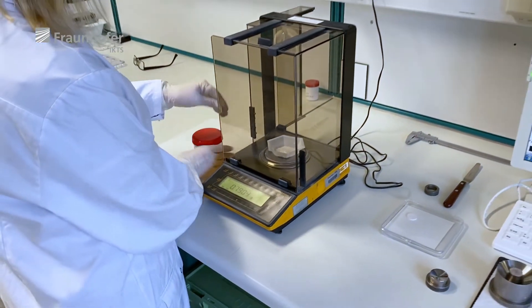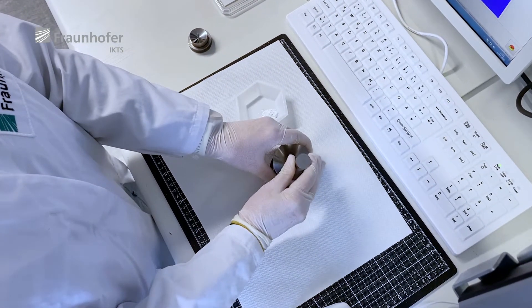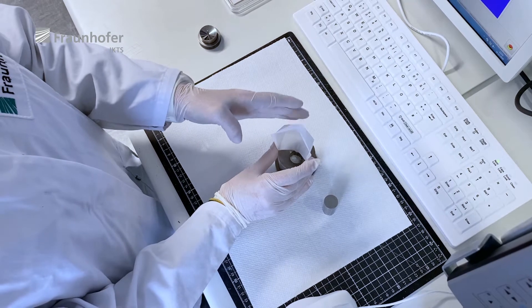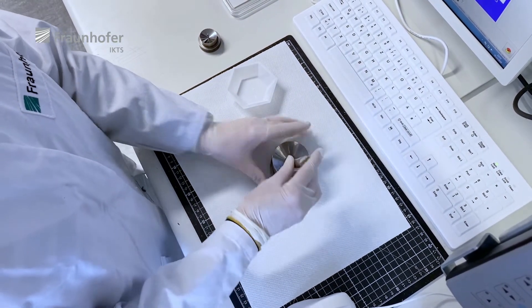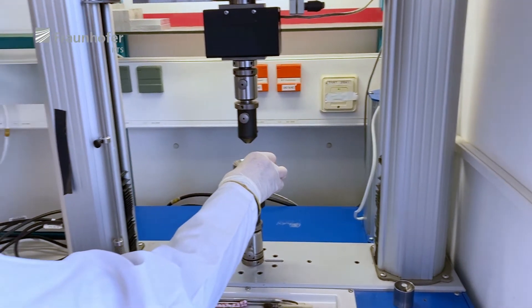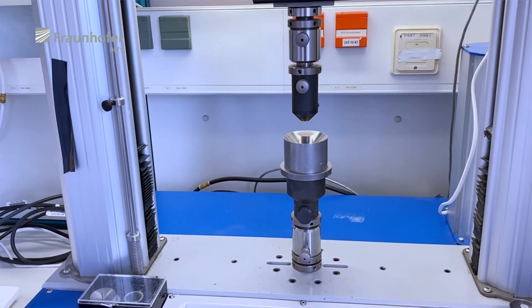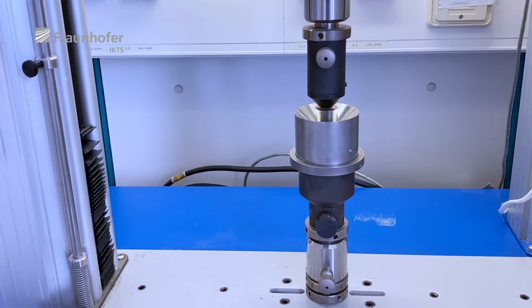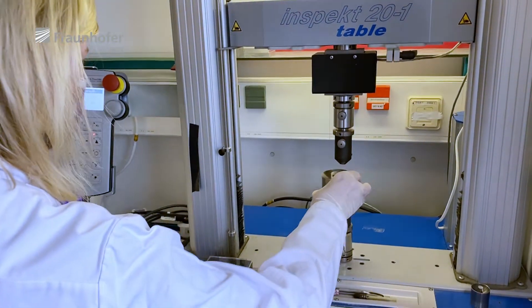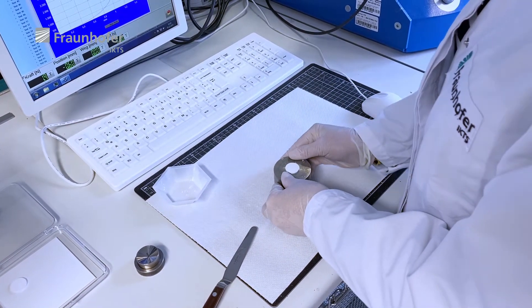The glass powder is weighed in the right proportion for preparing the sample. After weighing, the glass powder is transferred into a mould made of hard steel. We use an instrumented press for the pressing process, where we can record the force and the distance of the stamp. This is necessary to get an idea of the densification behavior of the powder. After the pressing process, we remove the powder compact from the mould and the sample is ready to be sintered.